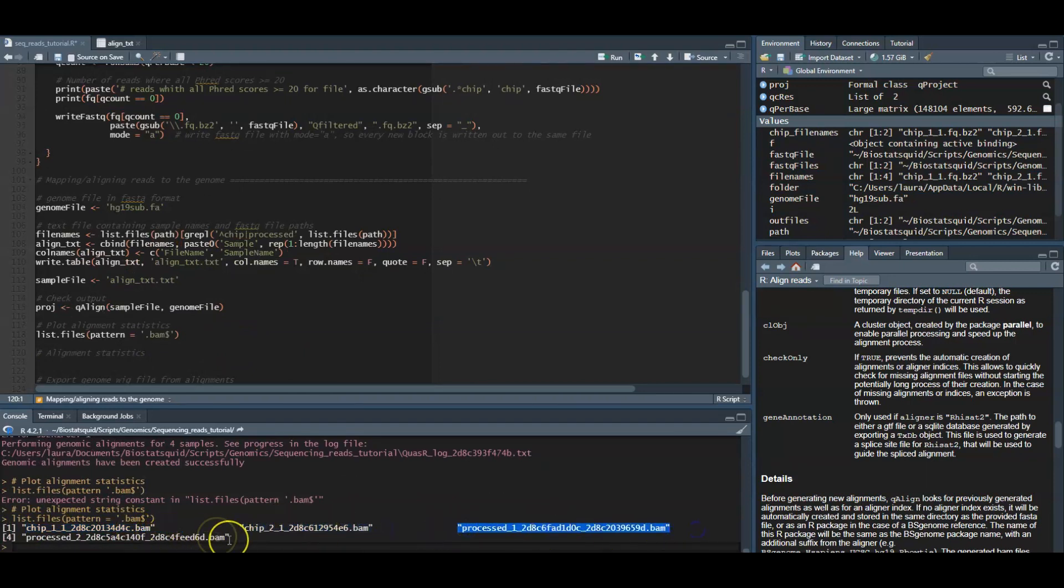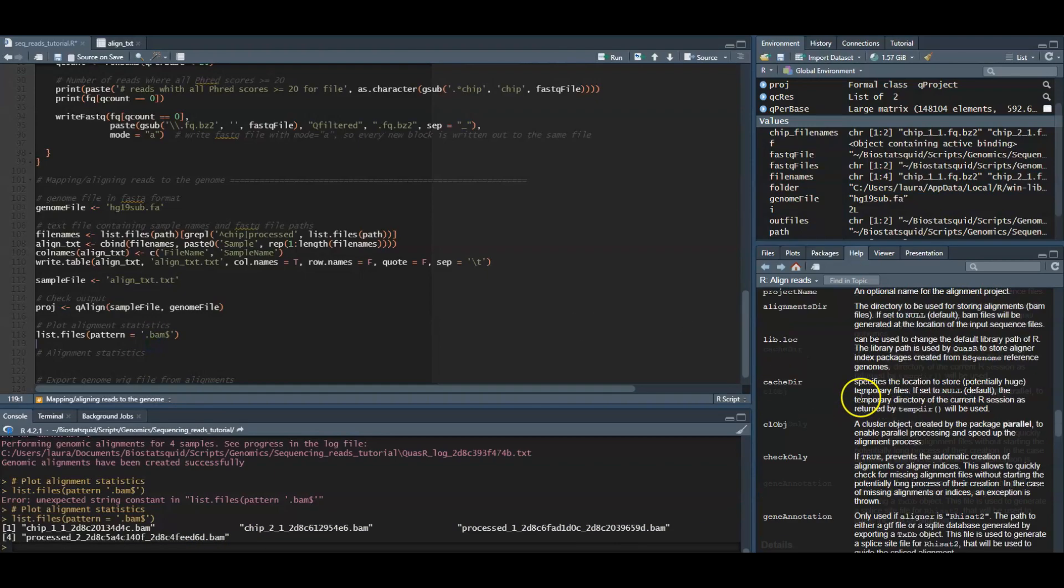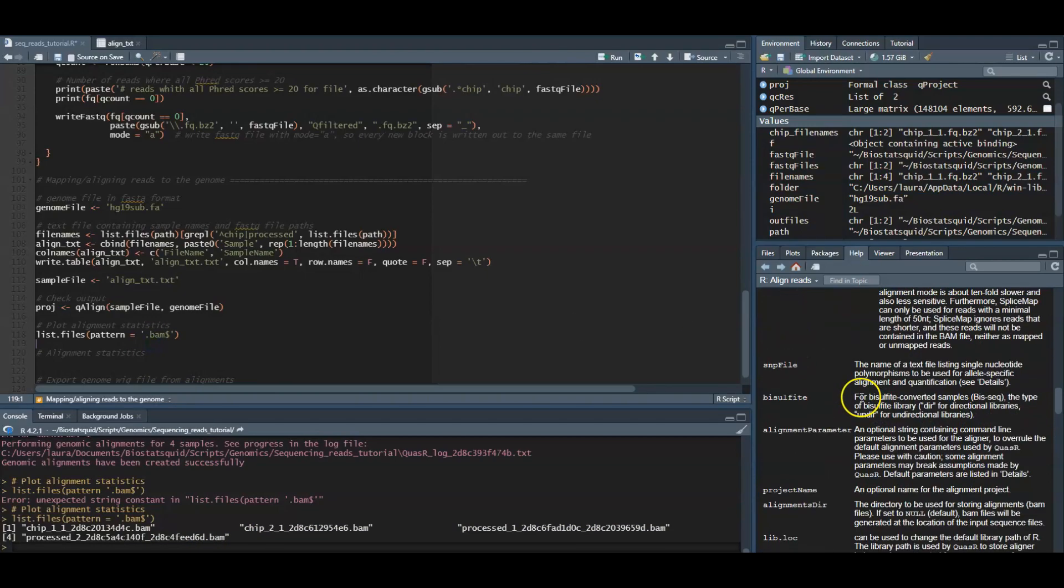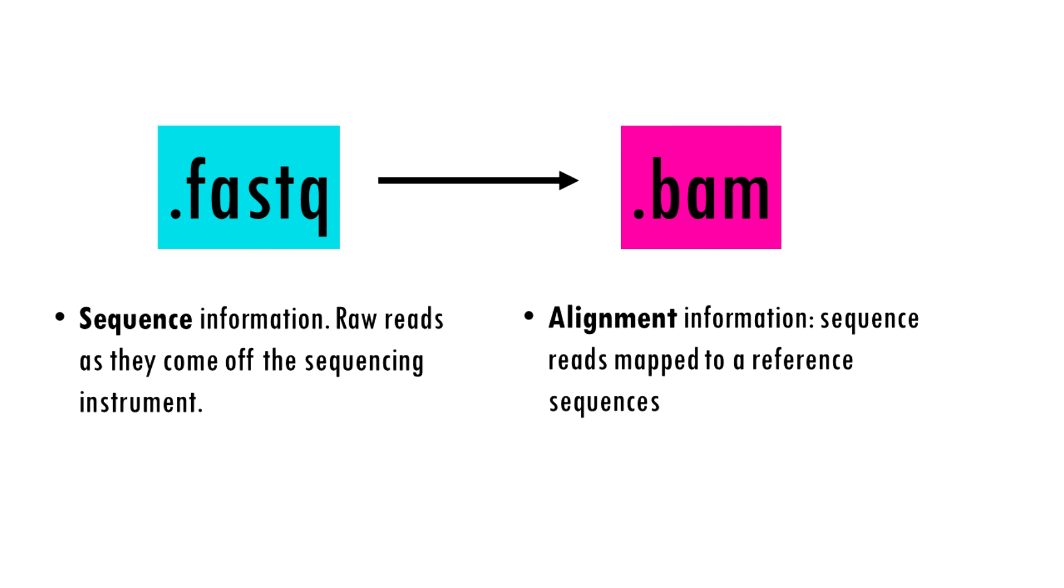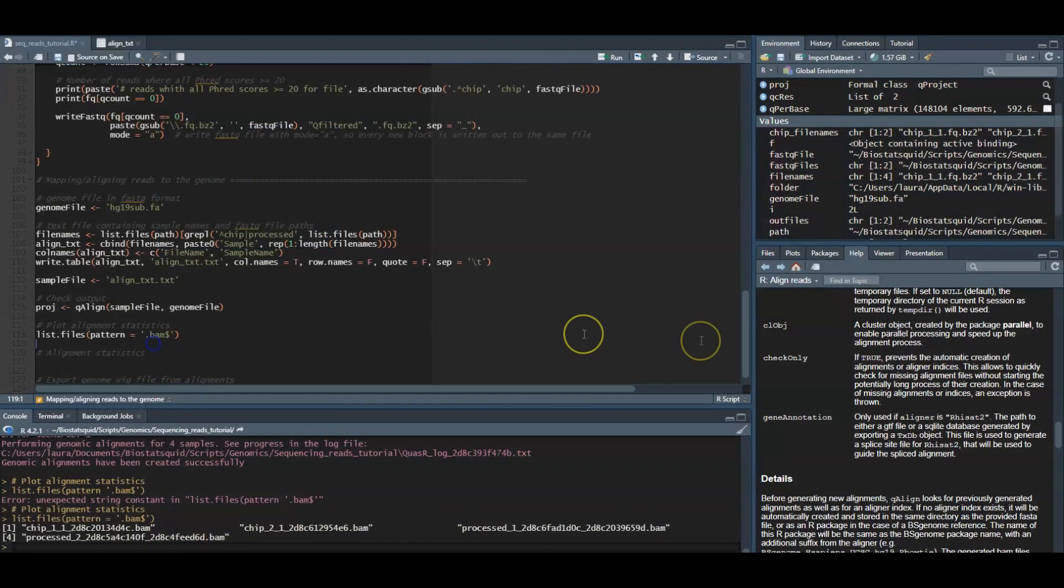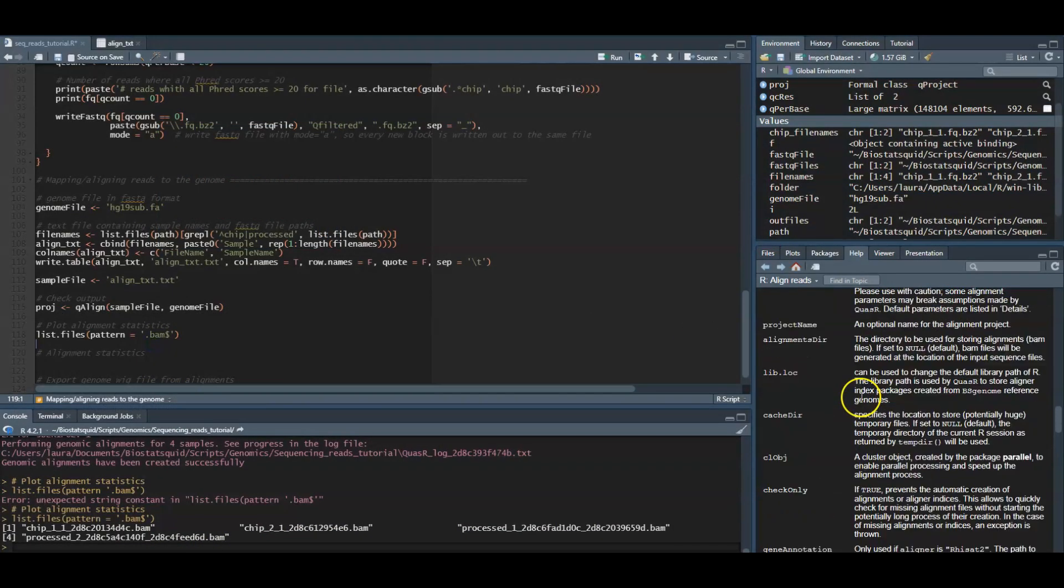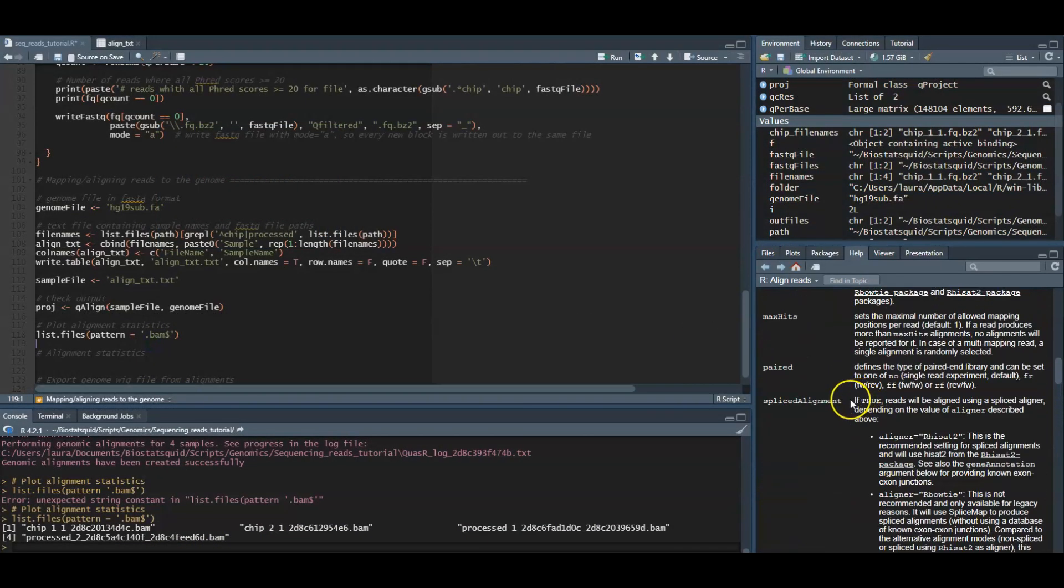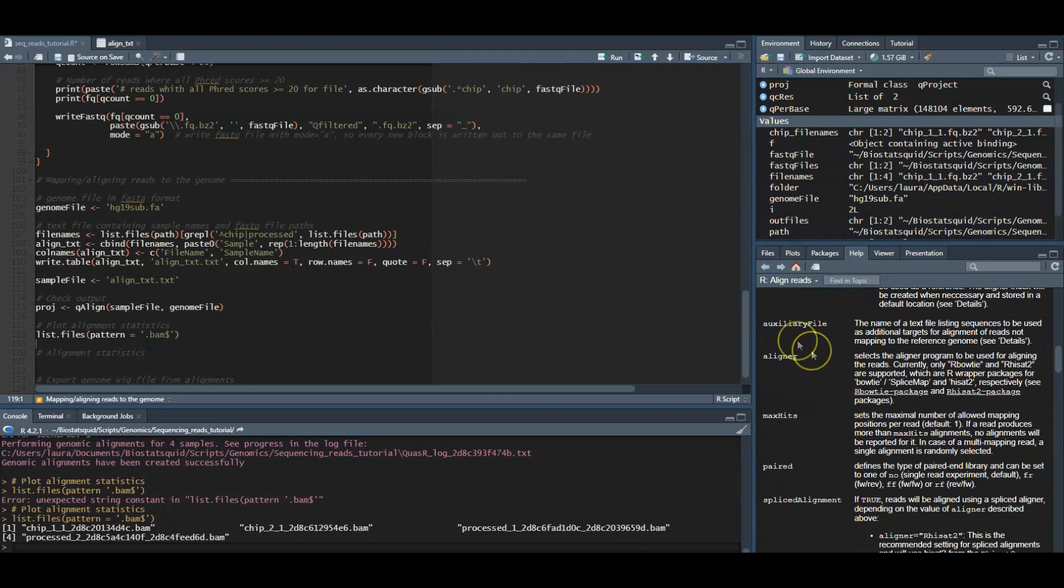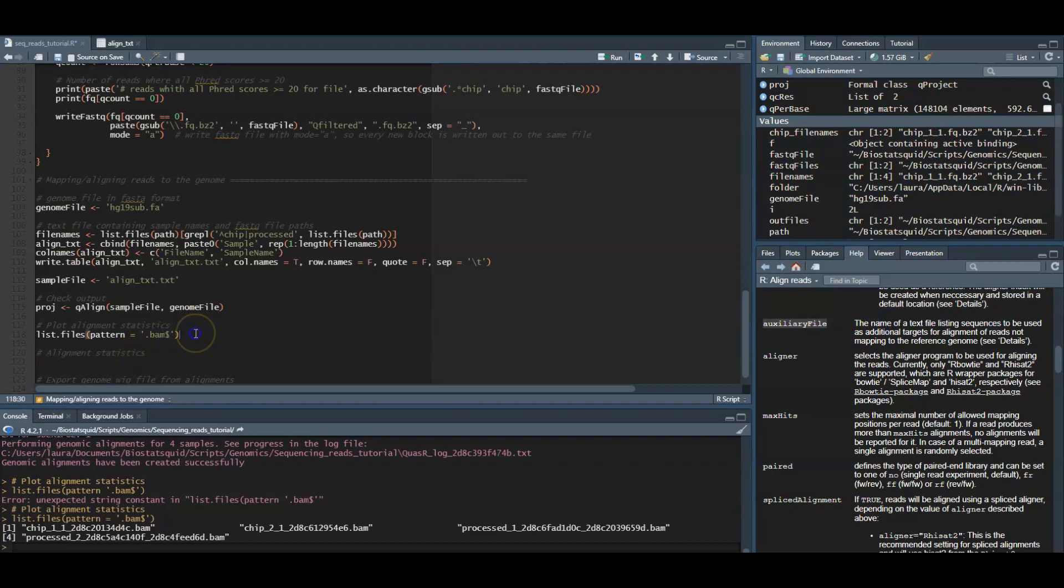For each input sequence file, there will be one BAM file with alignments against the reference genome. As you probably know, BAM files are the files for sequence alignment. They contain alignment data as well as everything in the FASTQ file. Now in this tutorial we didn't use it, but you can add an auxiliary file which contains other sequences which can also be used as additional targets to align reads that do not map to the reference genome. So you might get extra BAM files if they map to these auxiliary sequences.